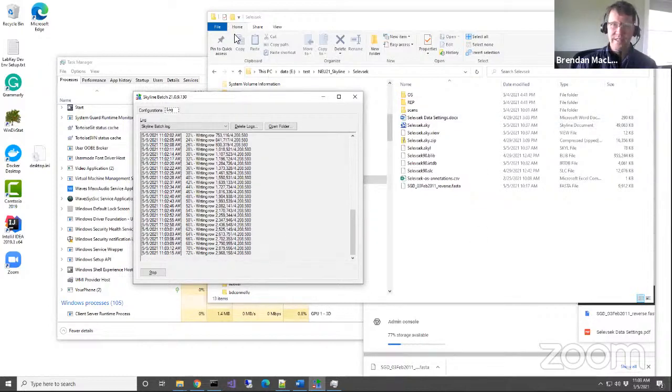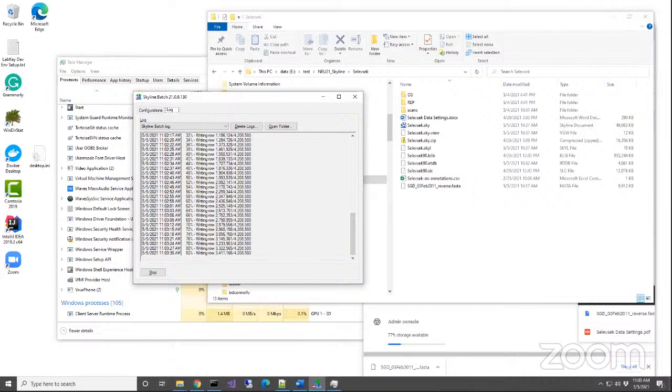There are questions. Tried reinstalling, got the same error. That's a Skyline batch error, Brendan, which I would love to go over with you, Lisa, later. If you can share your screen, that would be really great to take a look at and figure out what's going on.